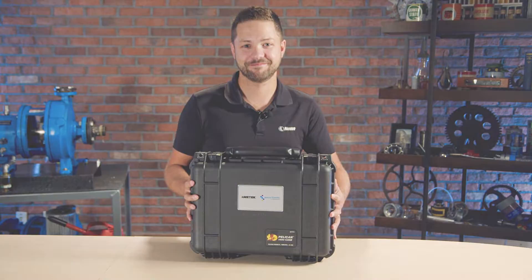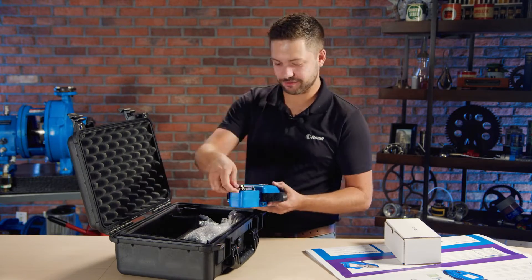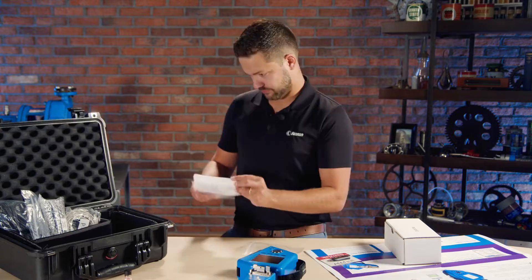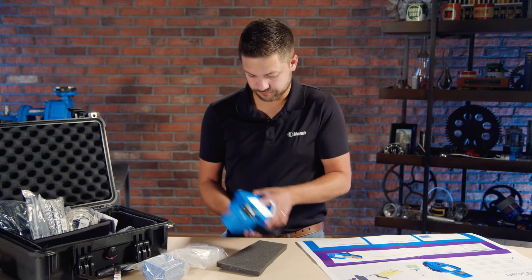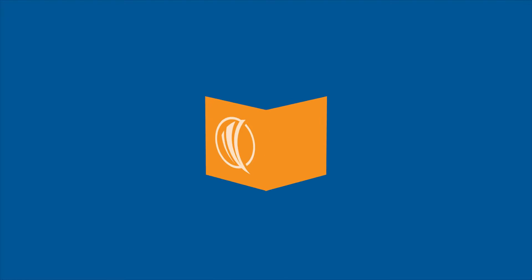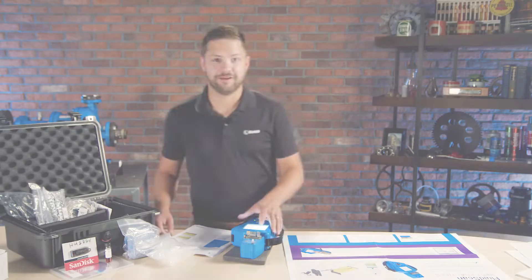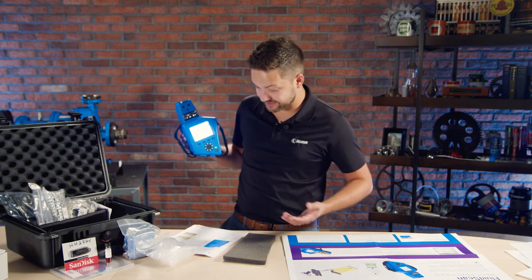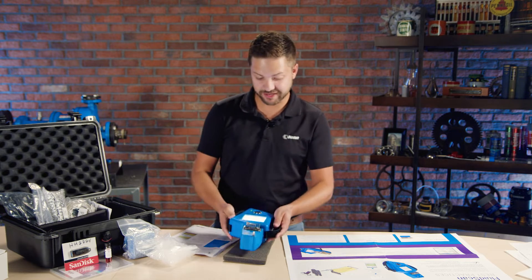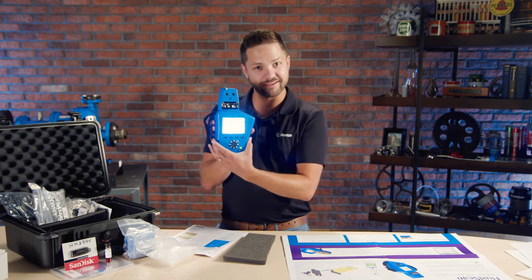Hey guys, Bennett Fitch here and welcome to another Noria unboxing. Today we have the SpecroScientific FluidScan. This is the 1100 series FluidScan and it's a really cool technology because it's an infrared spectrometer in a handheld device.